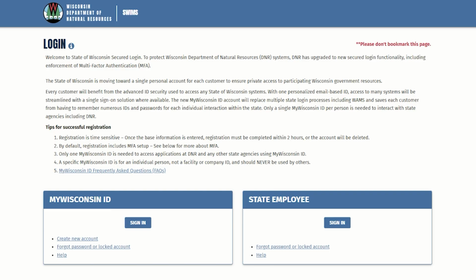We have a separate video that shows how to create a new username and link it to a previous account in the database. Please reach out to us if you need any help creating a new account or entering data.